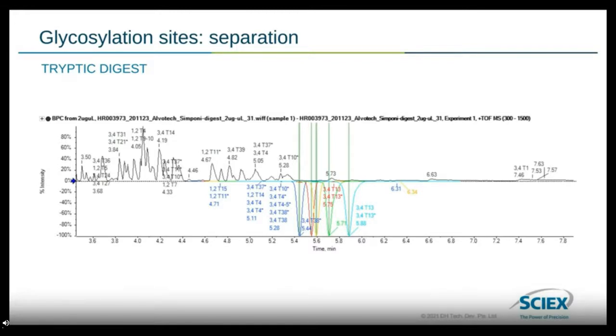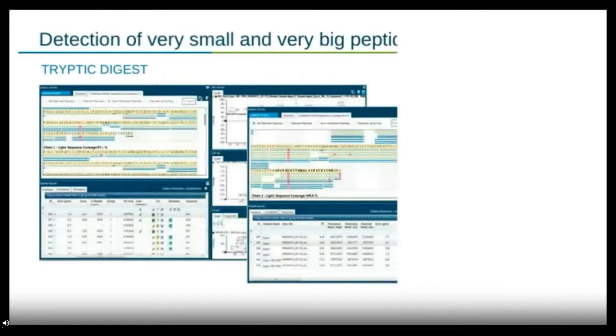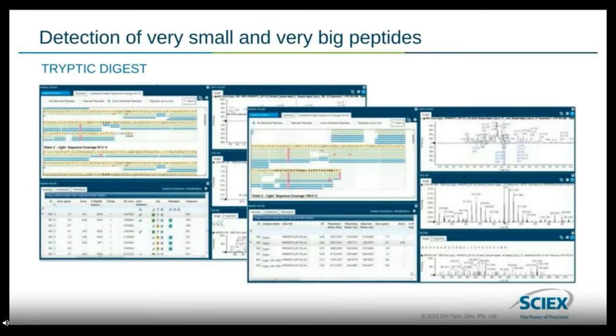So next slide. The same holds true for glycosylated peptides. Also here we need a very good separation to be able to quantify relatively the glycosylated peptides from the non-glycosylated peptides, and also do a relative quantitation between the glycosylation sites. Also here you can see there's almost a baseline separation between the glycopeptides. This is also not always given in LCMS.